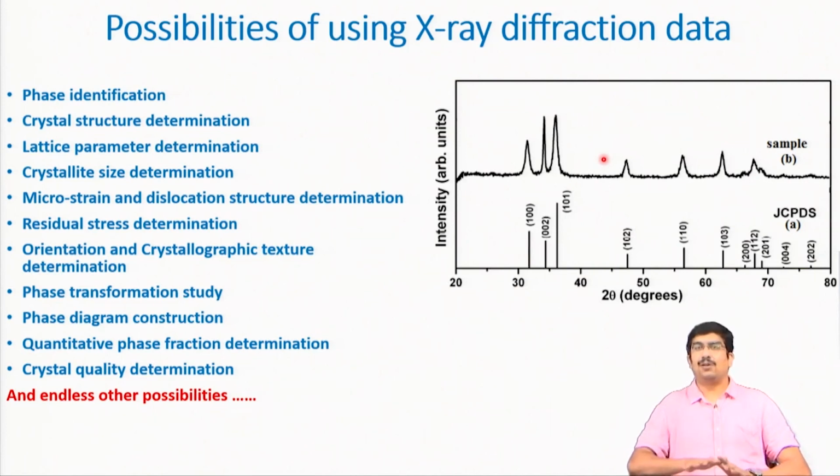The underlying phenomenon is of course X-ray diffraction, but there you have to go even a little higher in terms of instrumentation. You have to give specific rotations to the specimen, and then you can determine other things, like pole figures, and the orientation distribution function, and so on. So, we are not going there.